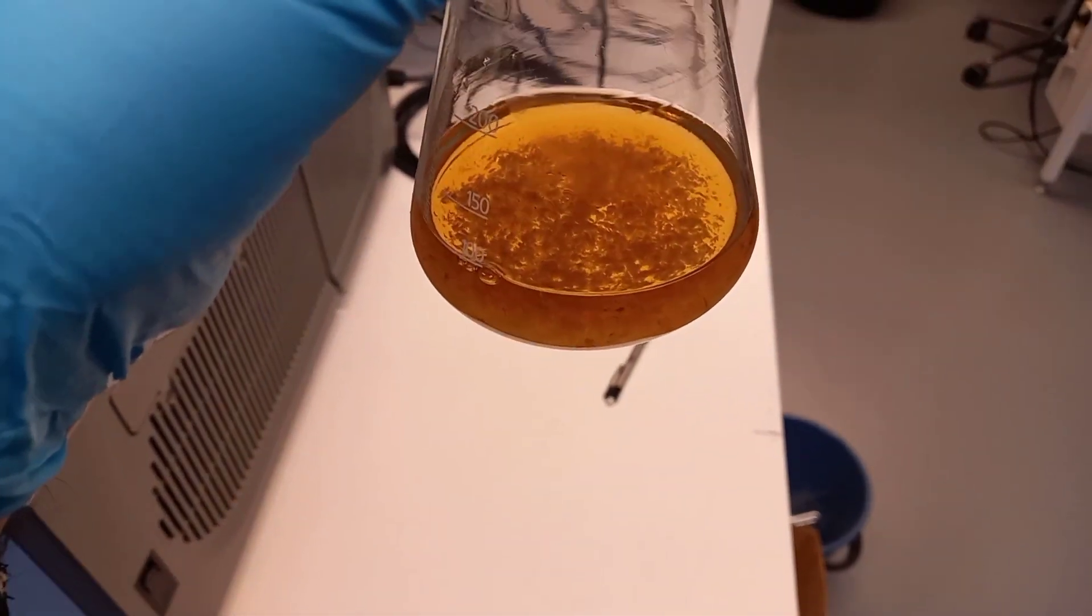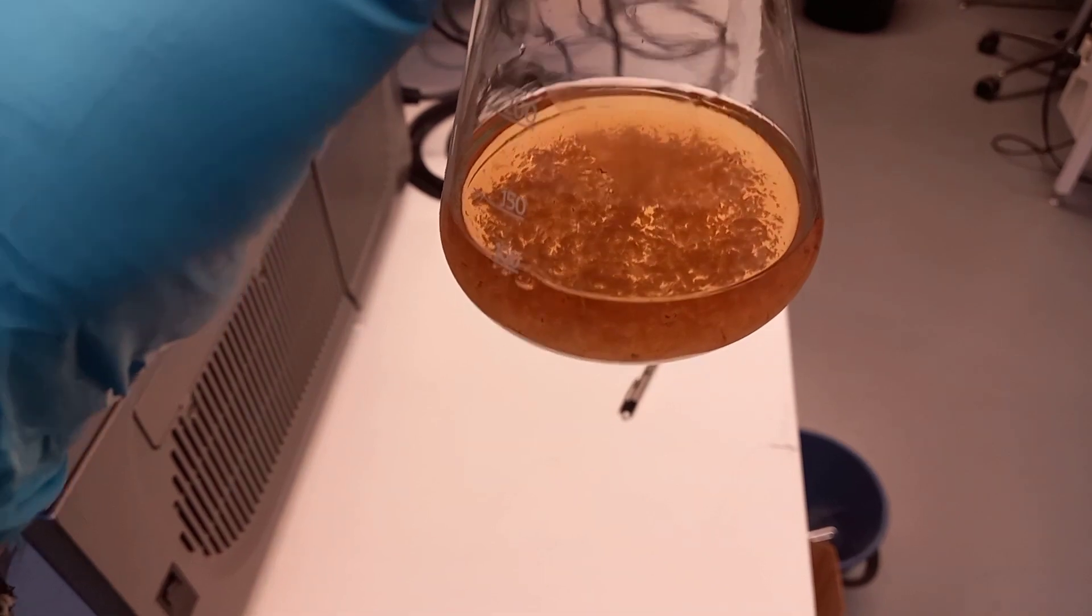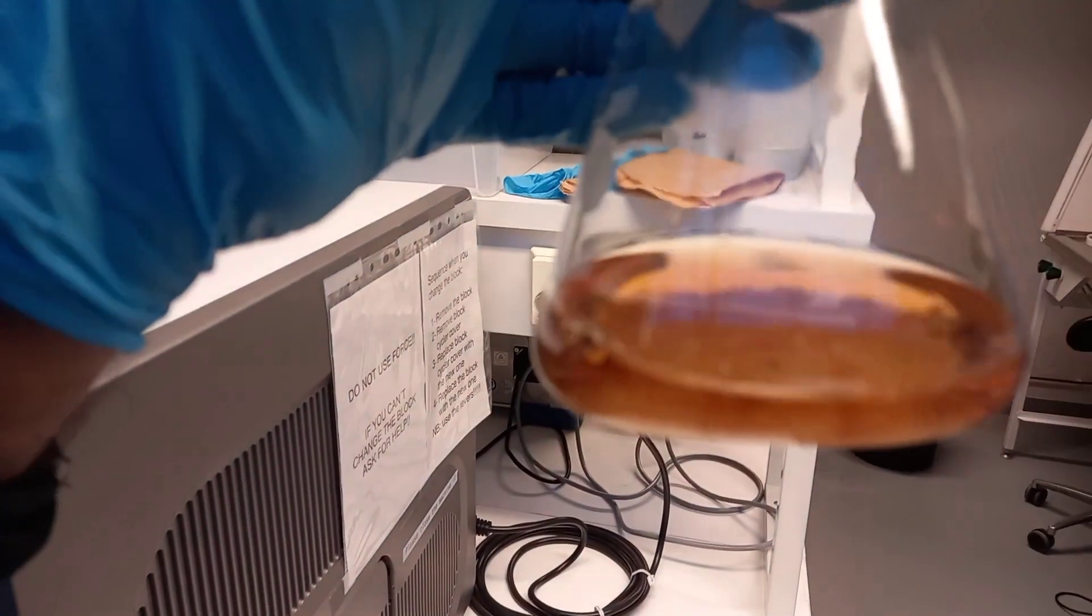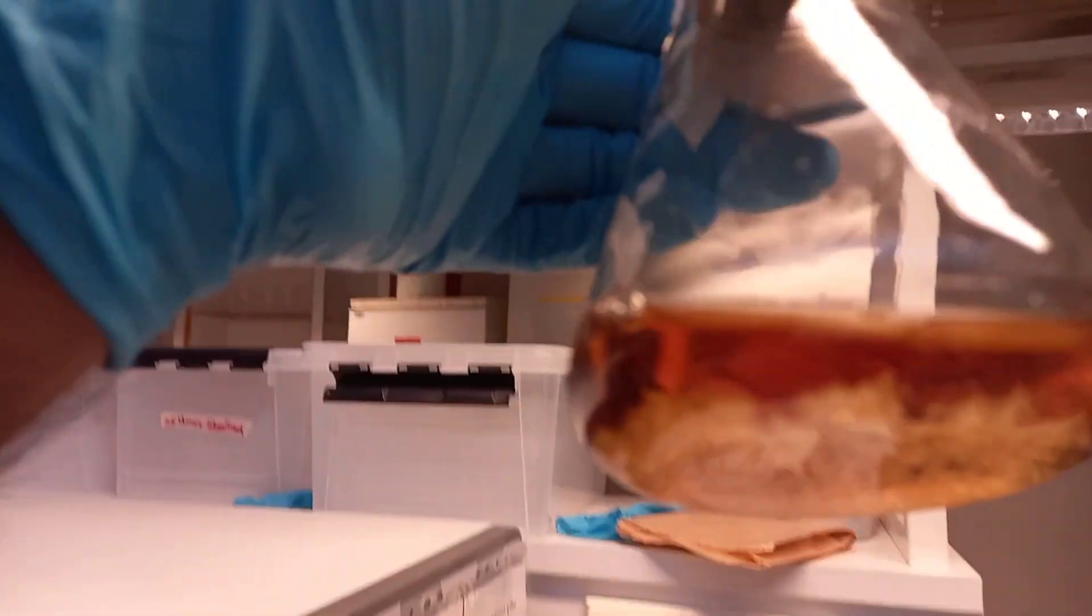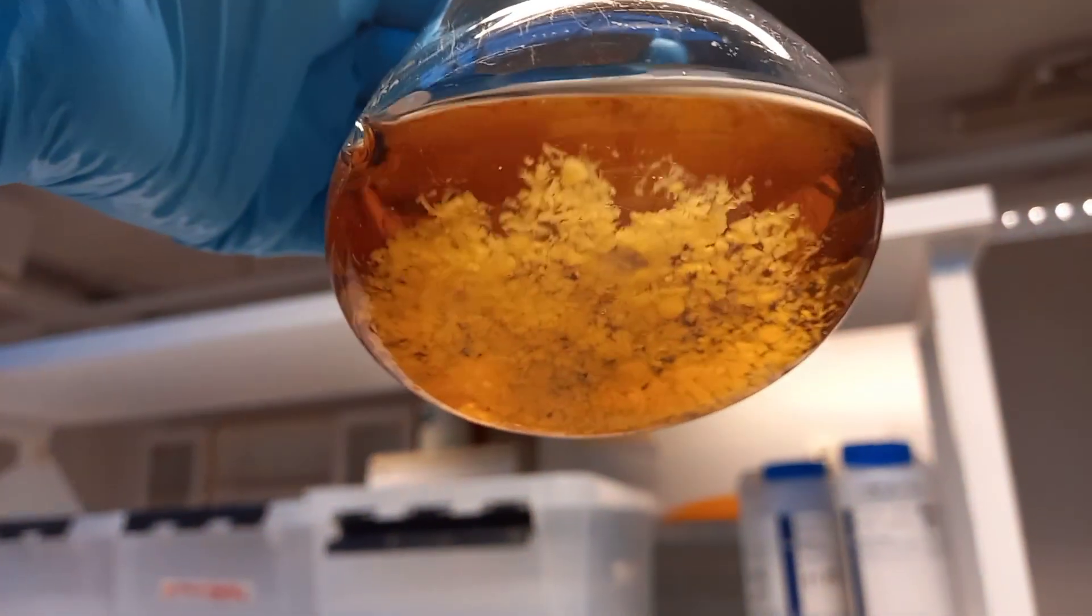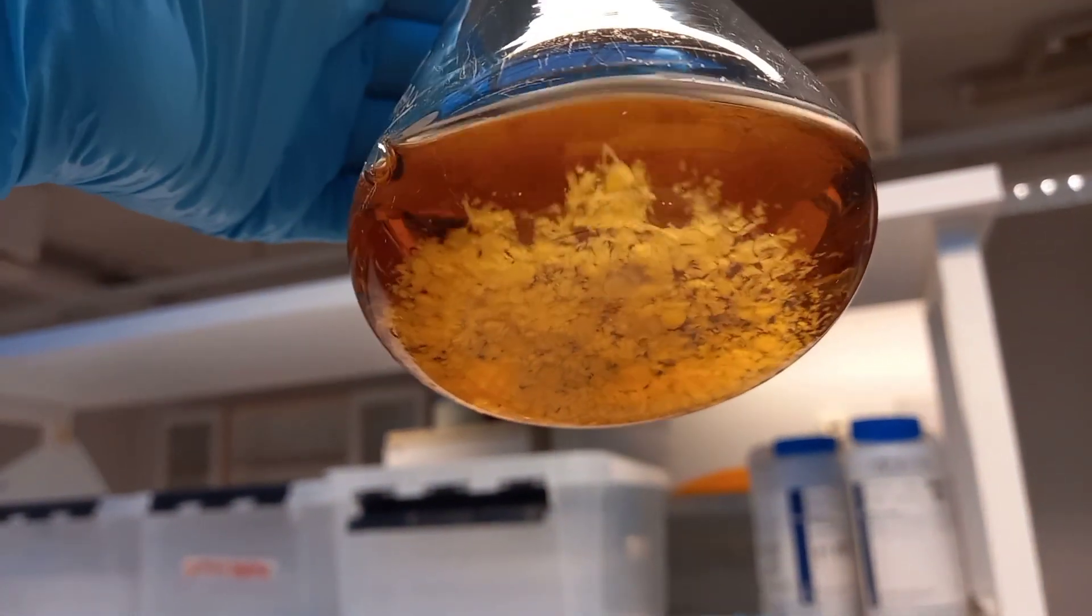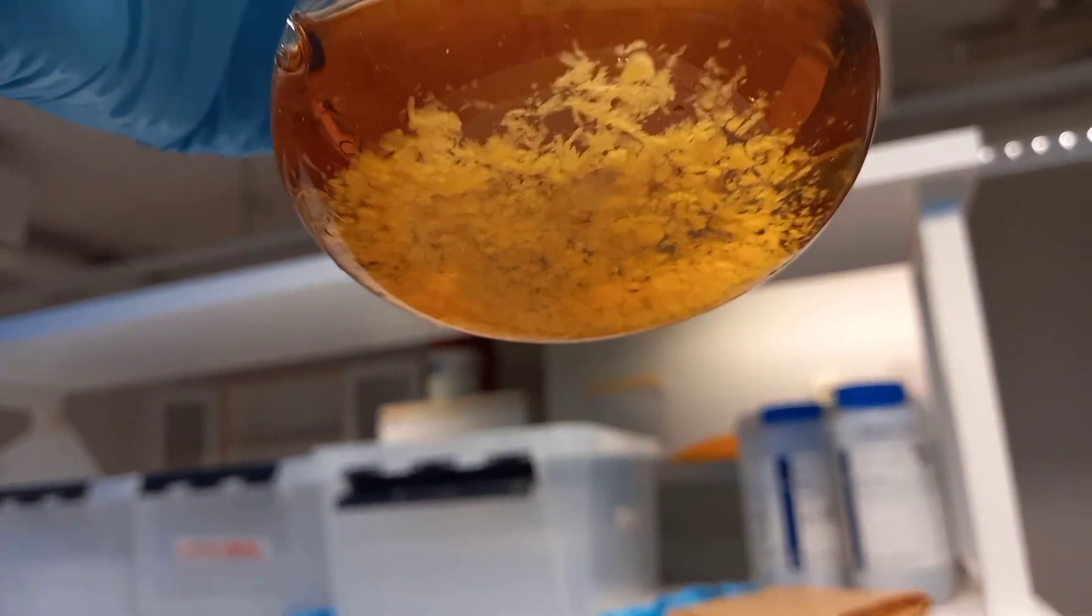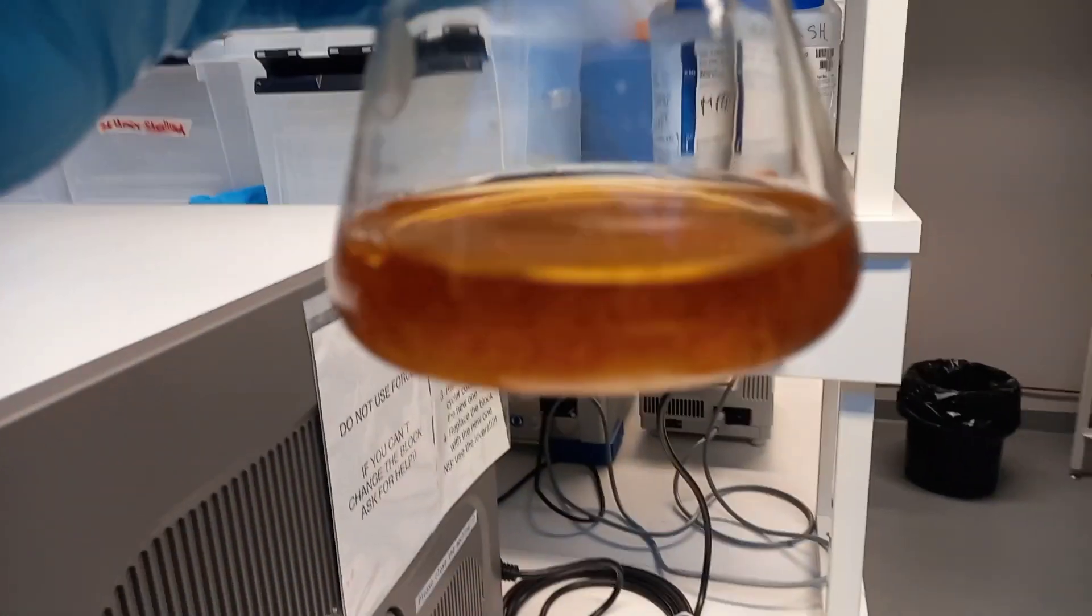You can see they have been grown in liquid medium of malt extract and have been kept for four weeks or 28 days. You can see this whitish microbial growth in the liquid medium. The Streptomyces grow in the form of hyphae.